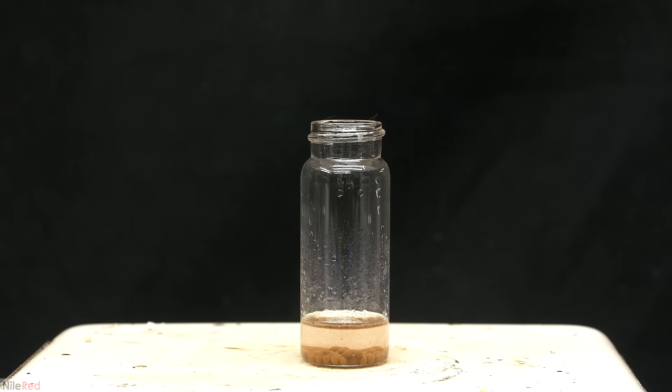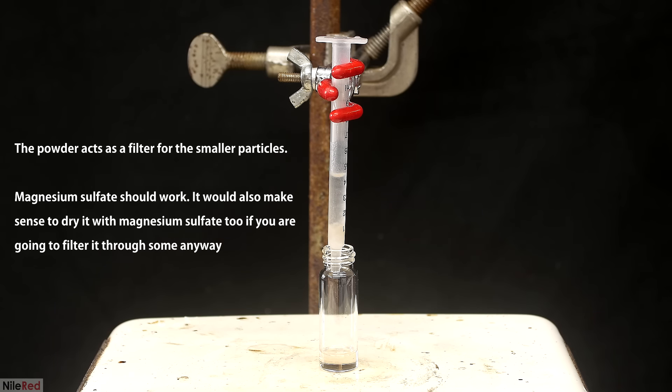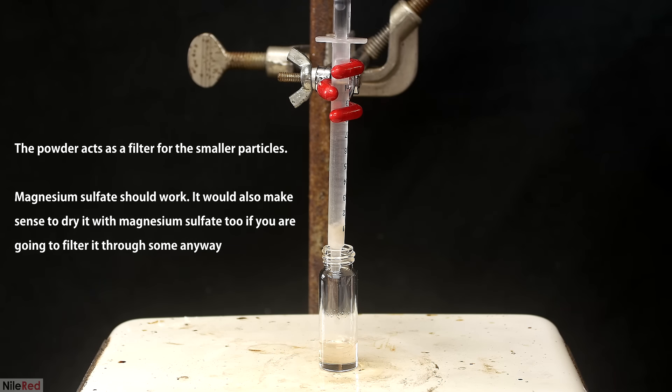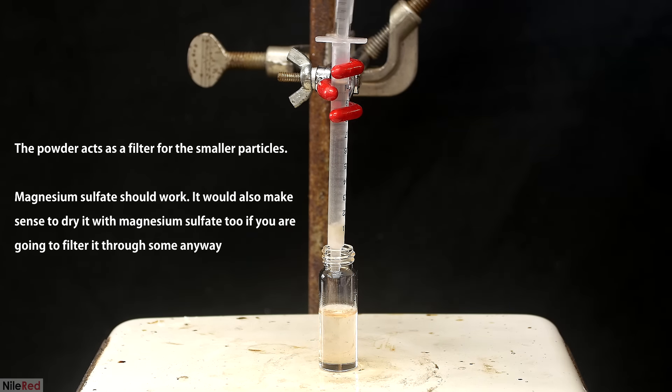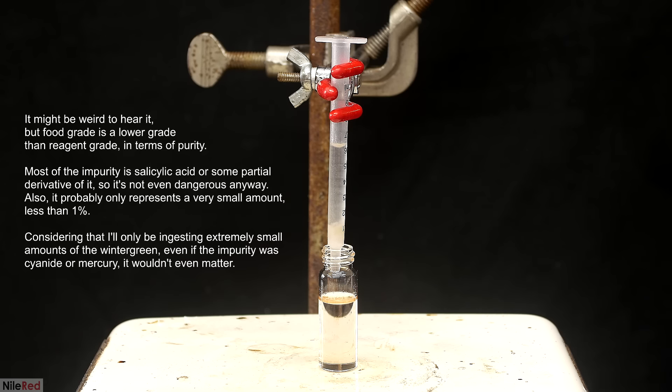The wintergreen cleared up quite a bit, but there was still some solid stuff floating around. So to get rid of it, I filtered it through some cotton and celite. If no celite's available, it can be replaced with a little bit of magnesium sulfate. The stuff that filters through is crystal clear, but it's tainted slightly yellow. The yellow color, as well as some other impurities, can be removed by distillation, but I decided not to do one.